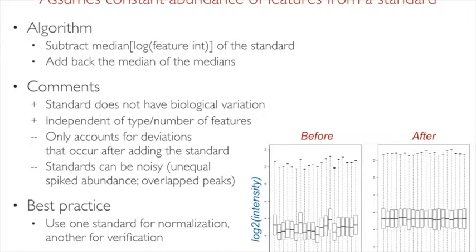This is the one that I don't like because it leads to overfitting very easily. It has many parameters and it can overfit your data. So it's useful for certain downstream analysis, but not for the type of things that we want to do here. So my attitude here is to normalize as little as possible, because you can really easily over-manipulate your data. And so I'll give you some example in a minute.